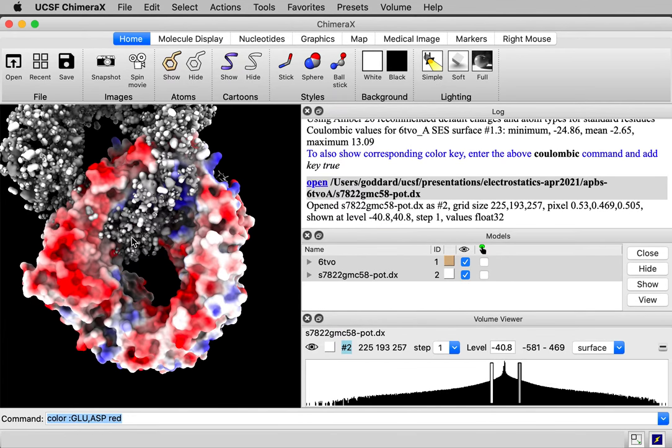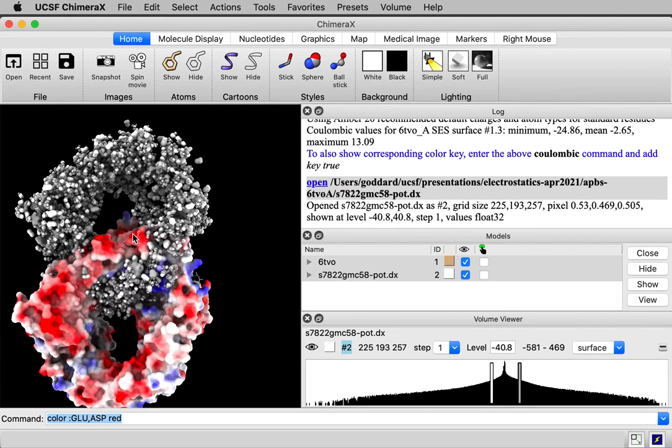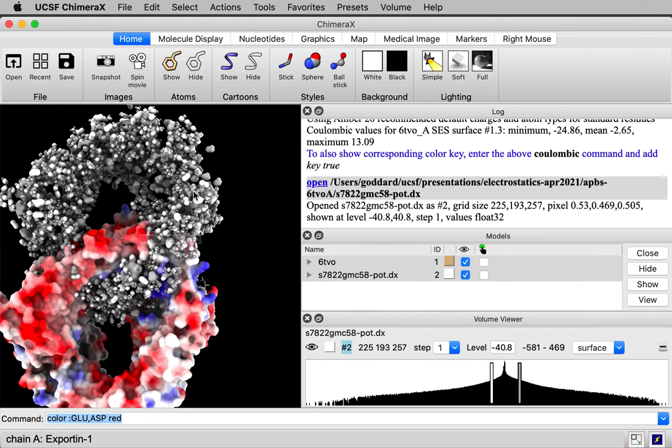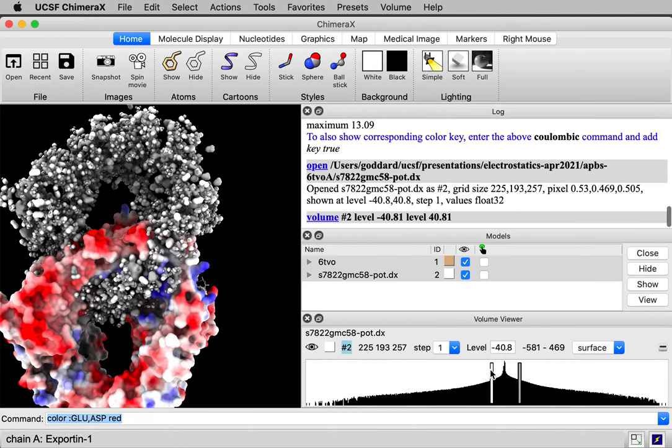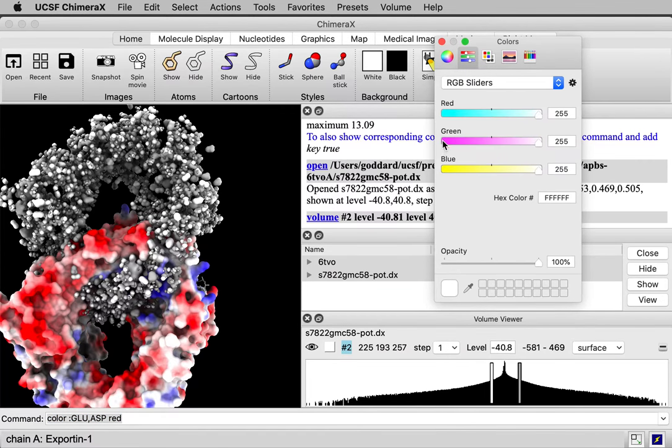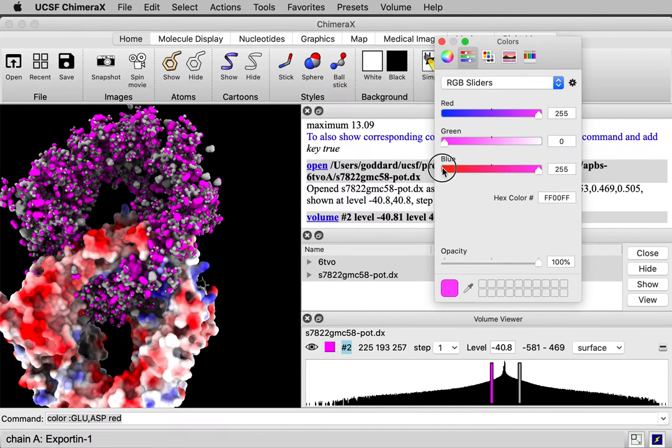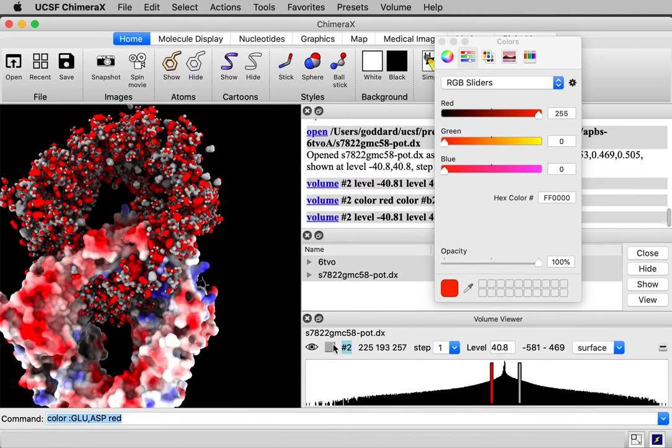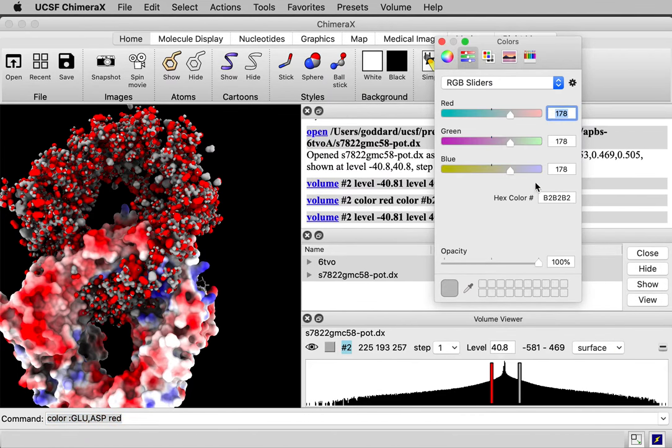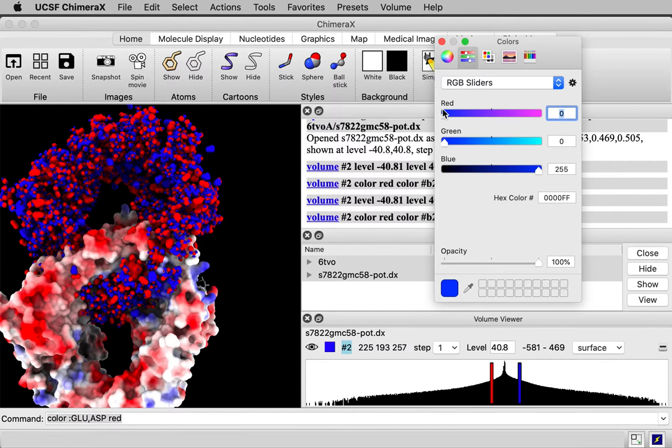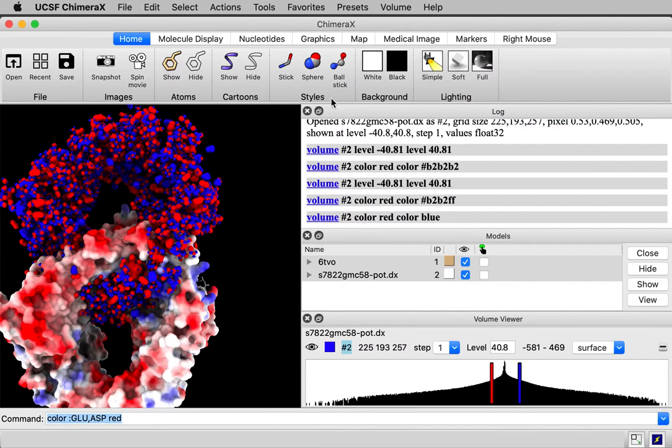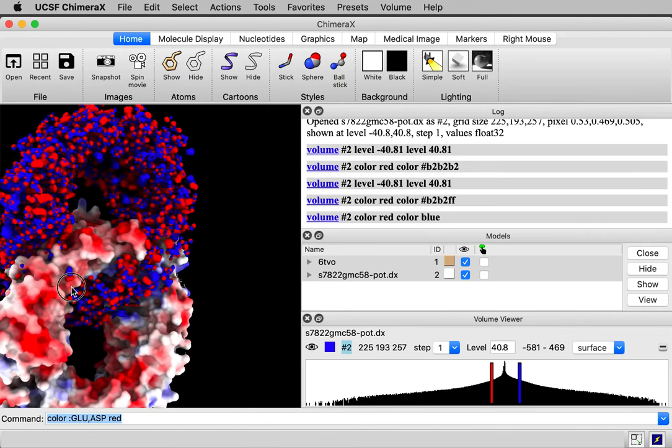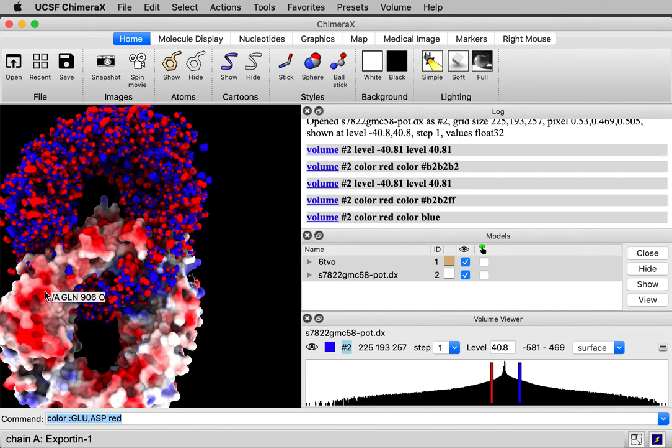When it's first opened, ChimeraX is displaying those potential values as a contour surface. And it's at two threshold levels. It's colored them just different shades of white. But I could, for instance, color them the negative one. And our typical coloring would be red. And the positive one would be colored blue. So this is the spatial distribution of the potential. But we want to color it onto the surface.